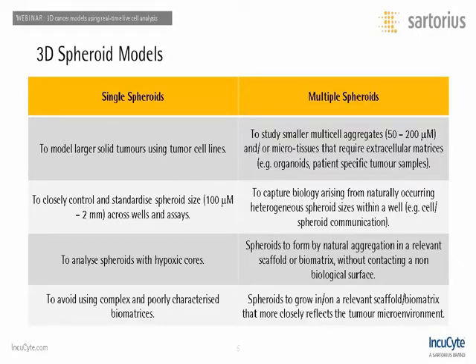This exquisite standardization of size and the formation of a single spheroid in each well of a microtiter plate makes this approach very compatible with industrial cancer drug discovery programs and achieving very strict high-throughput screening performance metrics.